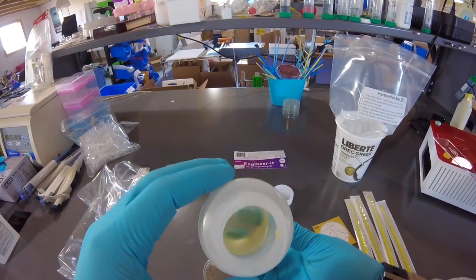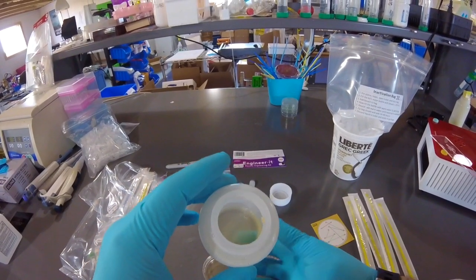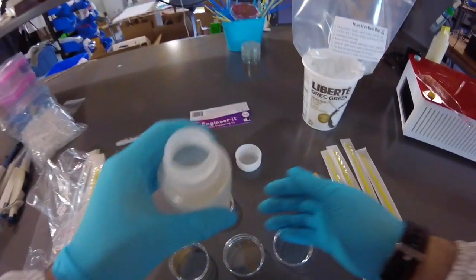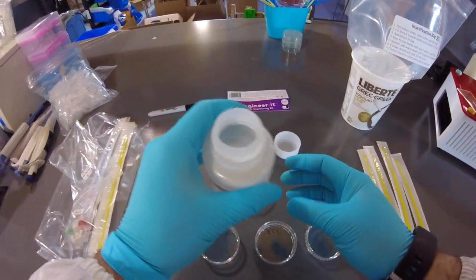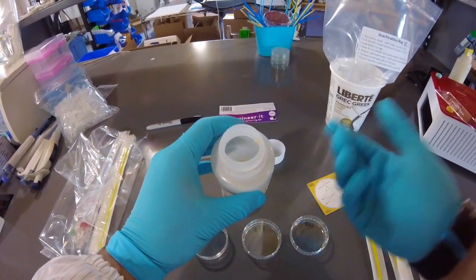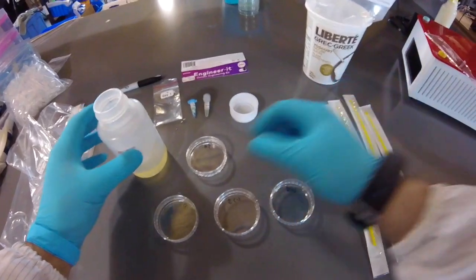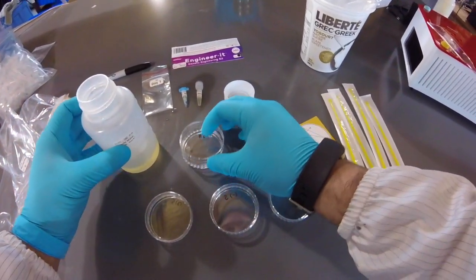That's a good sign. If it's cloudy and you see little white powder floating around, that means you need to microwave it a little bit more. Because if you just go ahead and pour your plate and you see that powdery cloudiness, it's not going to turn into a gel afterwards because the agar didn't fully dissolve.